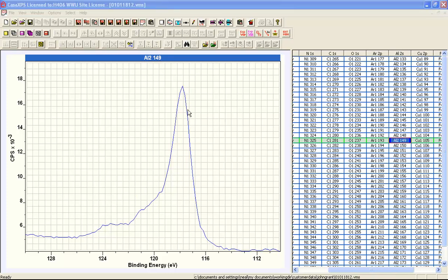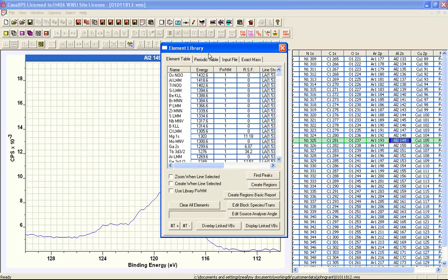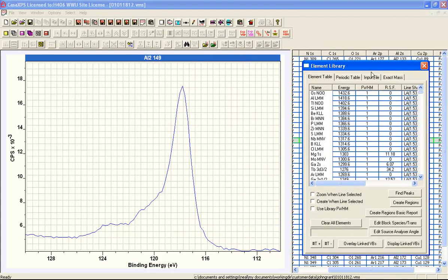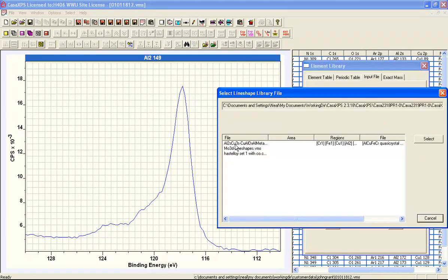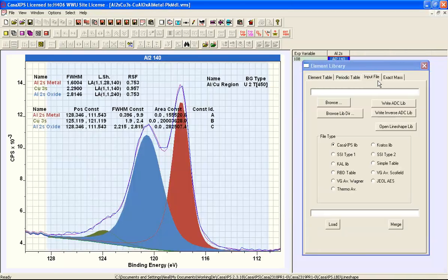What is required is a peak model for these data. In a previous video I looked at how to produce such a peak model, and I've saved part of that work as a separate file in a directory that I can recover using the input file property page on the element library dialog. Here you see one of the peak models used in that previous video.